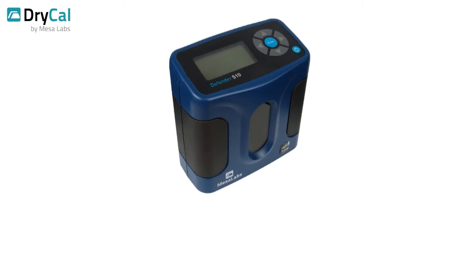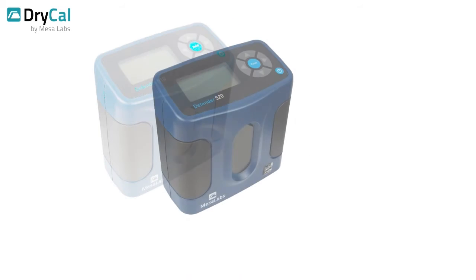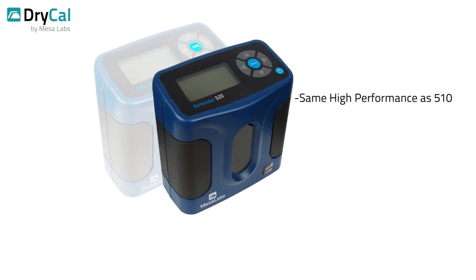The Defender comes in three models to meet an exceptionally broad range of flow measurement needs and circumstances. The basic Defender 510 weighs in at just 29 ounces, yet delivers consistent volumetric readings with a measurement uncertainty of just 1%. The 520 model delivers the same high performance, but adds the capacity to record ambient temperature and pressure conditions.